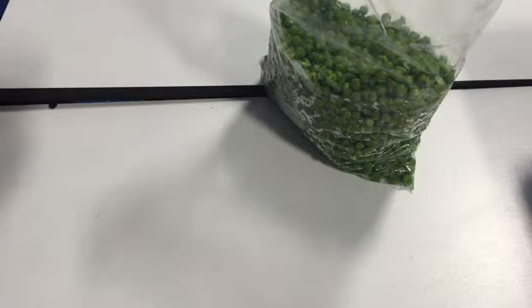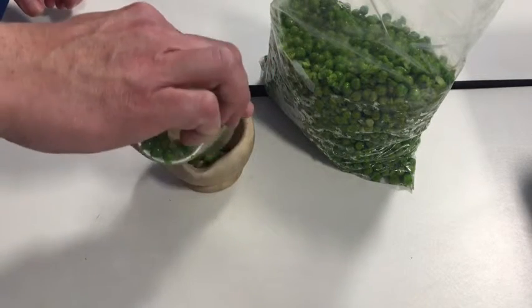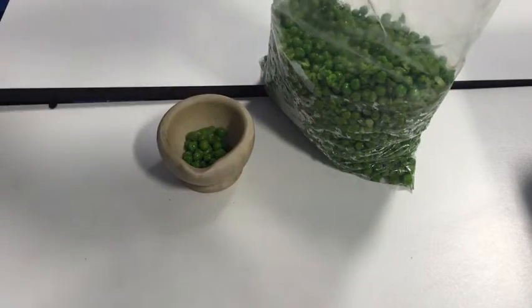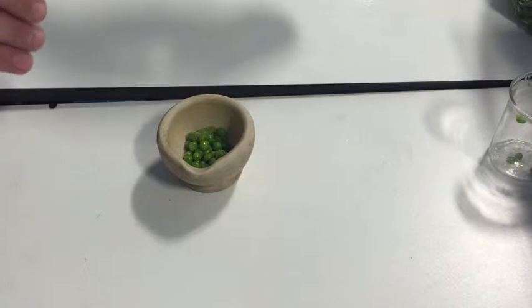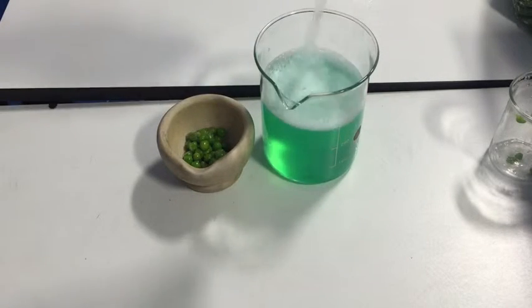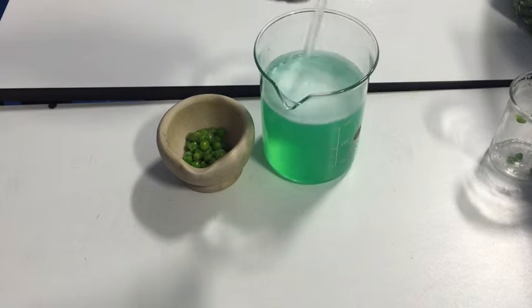We want to basically get it to the consistency of baby food — really mulch it up. What we're doing is breaking up the cells, getting all the cells separated. Now I'm going to take my cocktail: it's washing up liquid — a detergent — it's salt and water. There's 300 millilitres in here: 30 millilitres of washing up liquid, 270 millilitres of water, and 12 grams of salt.